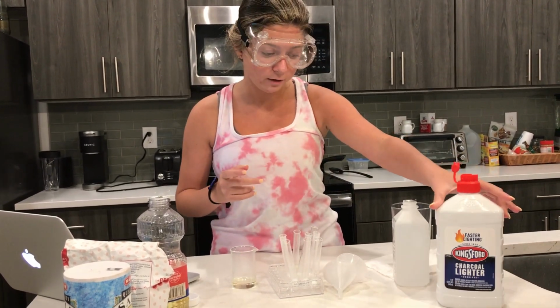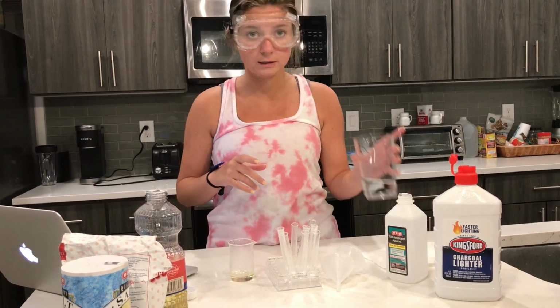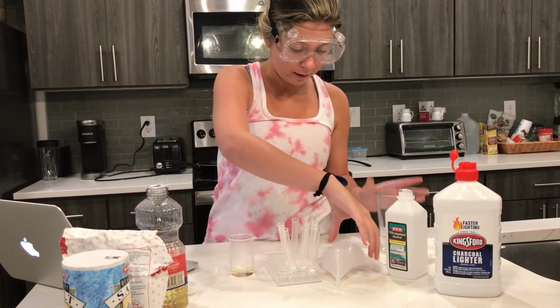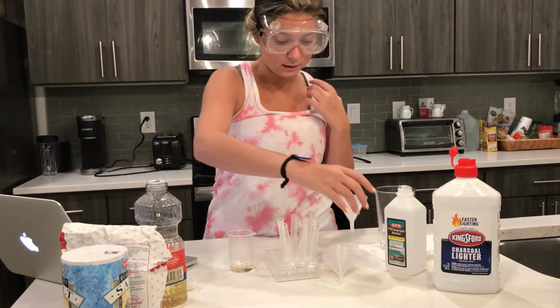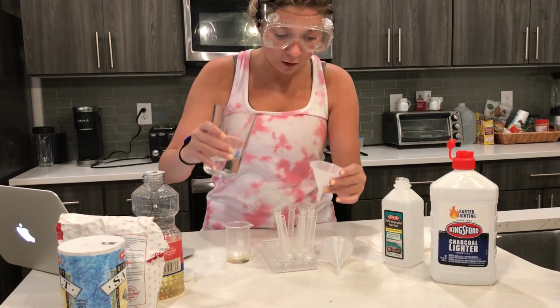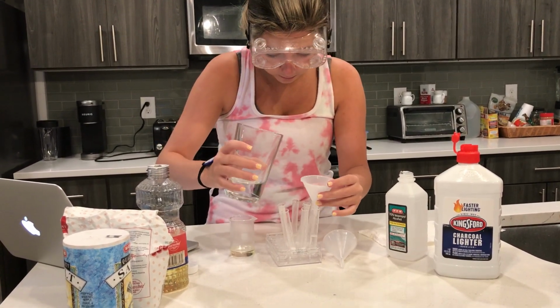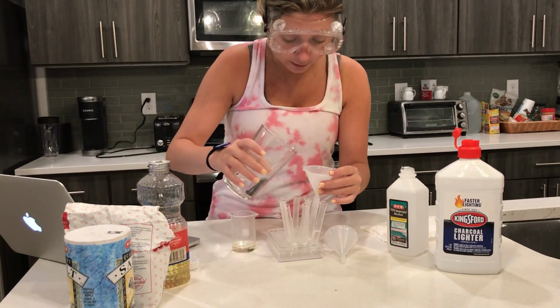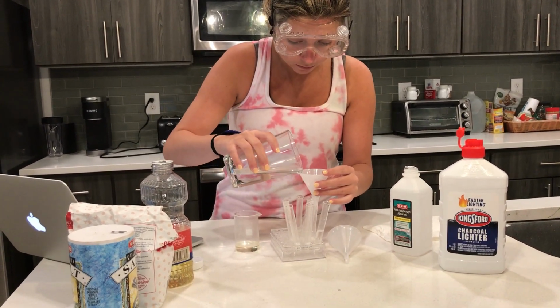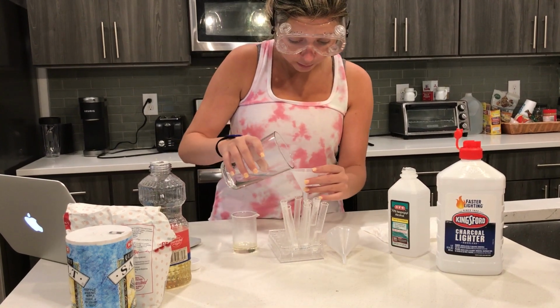So I have lighter fluid, and then isopropyl alcohol, and then some water. So I'm just going to start pouring these into my little test tubes with my funnel. So I'm going to start with water and salt. Okay, and then water and sugar. And then water and oil.